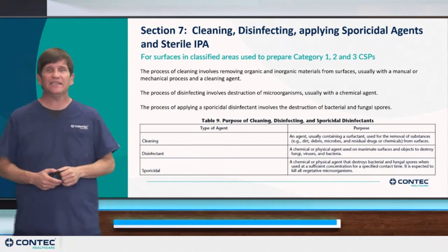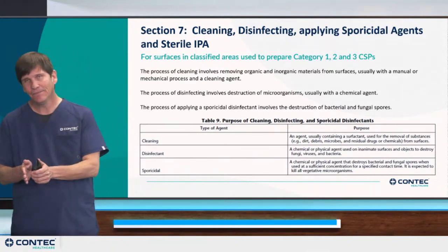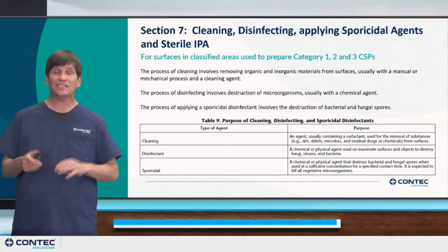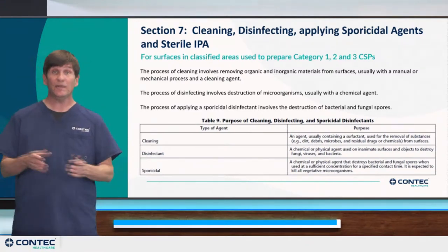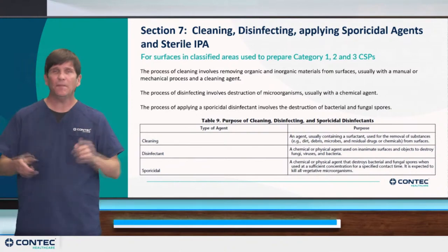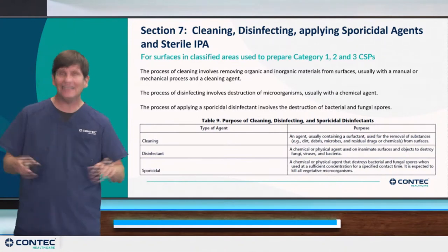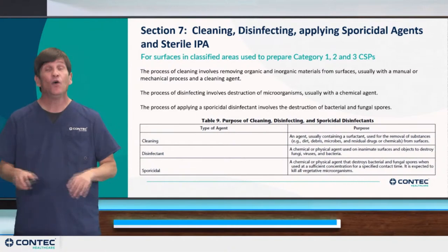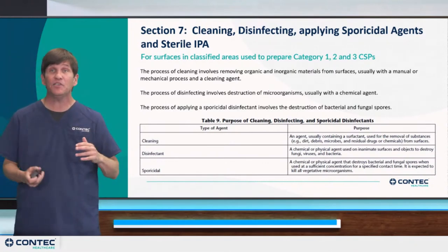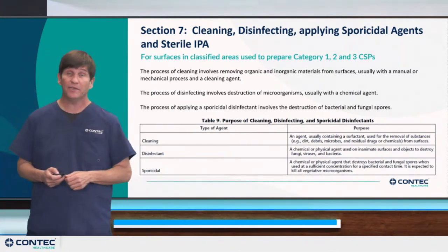Table 9 in the chapter sort of breaks this out a little bit further. I've always used that old adage that you can clean without disinfecting, but you can't disinfect without cleaning. And oftentimes you'll see talk about people taking a pre-cleaning step before they apply a disinfectant. And that was really a part of this breakdown. Clean, disinfect, and then there's a sporicidal application. As we'll talk about in a minute, there are EPA registered one-step cleaner disinfectants that make that pre-cleaning step not necessary, because just applying that one-step cleaner disinfectant is going to do both clean and disinfect in the same step. So depending on the chemistry you're using, you could turn this into two tasks instead of those distinct three definitions that the chapter has broken out for you.